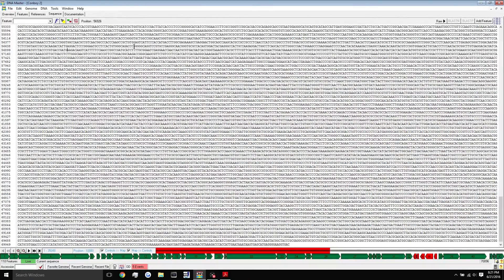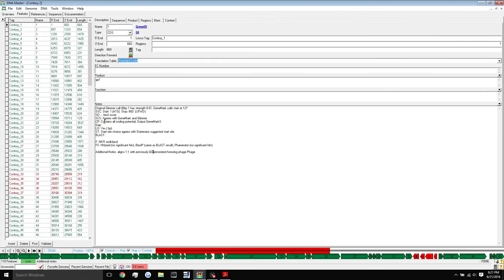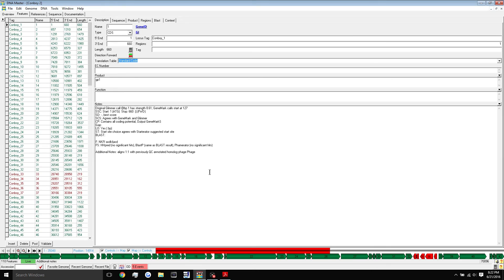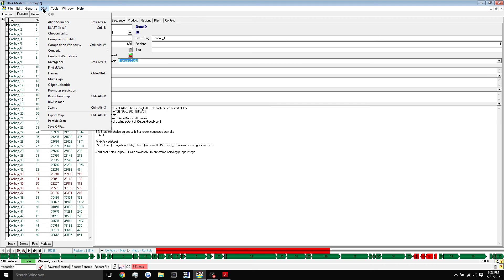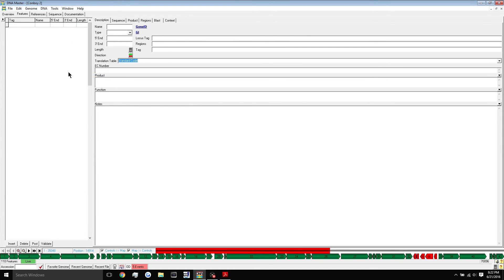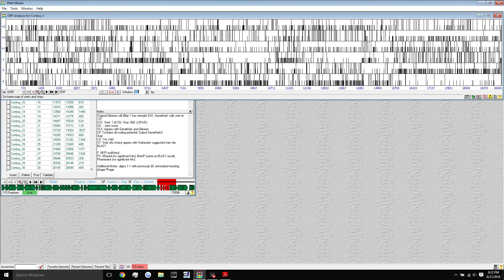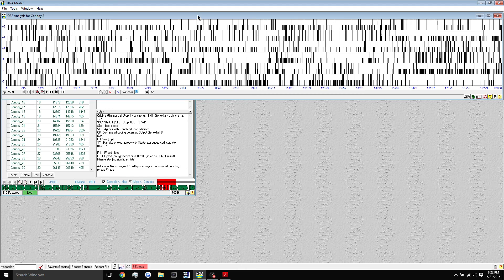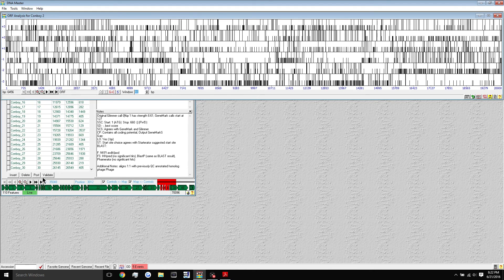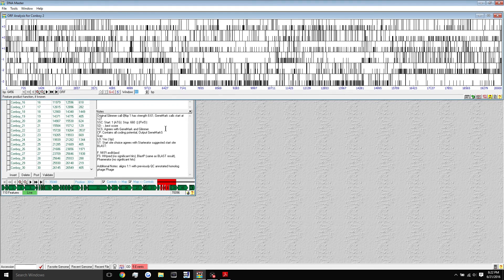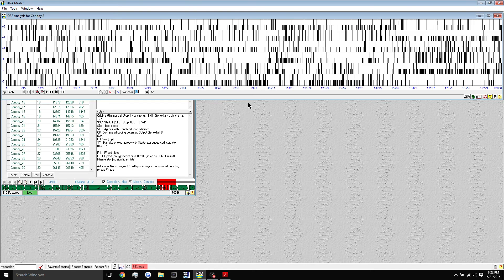Another thing you'll have to do for every gene during the annotation process is the SD score and the longest open reading frame. This requires a separate window for you to open each time. All you have to do to open that window is head up here into DNA and scroll down to here where it says frame. When you click frames, this separate window will pop up. Make sure you post changes before opening frames because you will lose that data if you didn't post your changes.